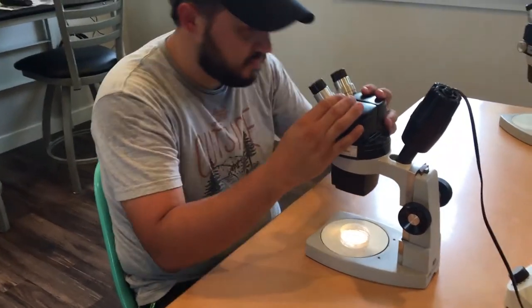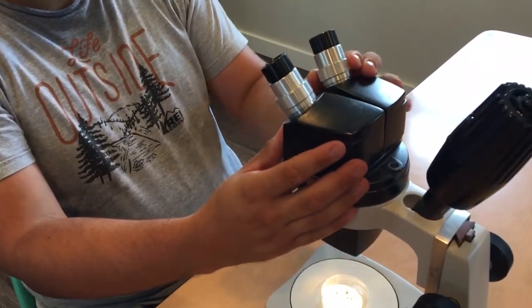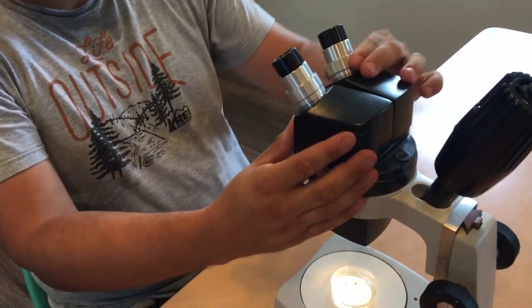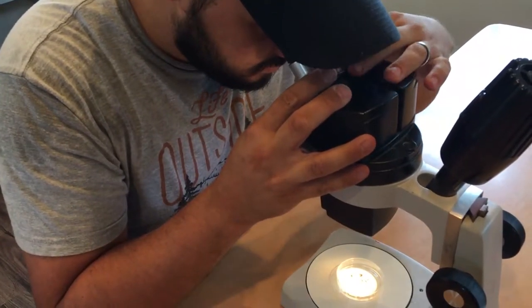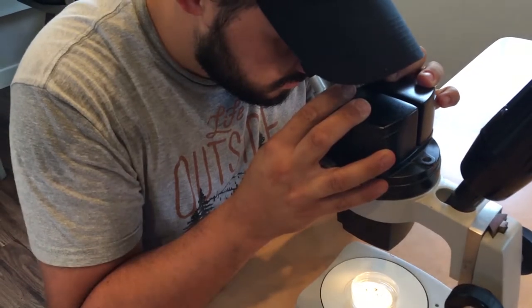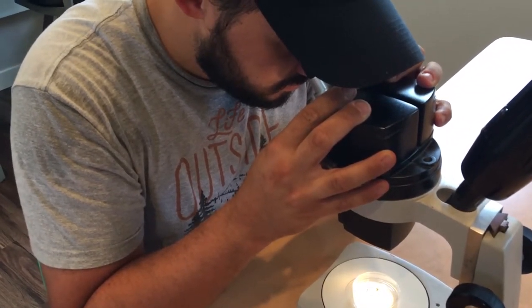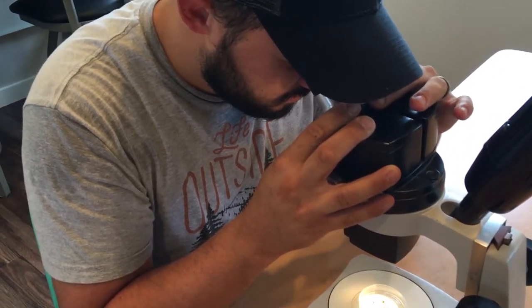There is one more fine adjustment we can make on our scopes. Sometimes our two eyes vary in their focusing ability, so there's a diopter adjustment knob on the left eyepiece of your microscope. You will recognize the diopter adjustment eyepiece by its knurled adjustment ring. To personalize your scope for your own eyes, look again through your eyepieces, but this time close the left eye — the one looking through the diopter.